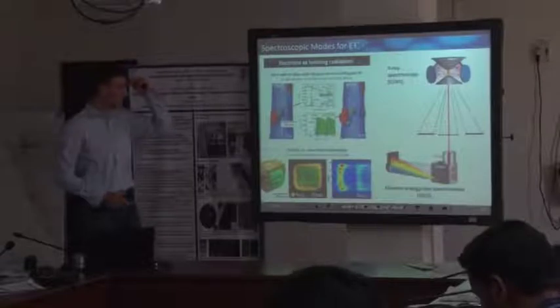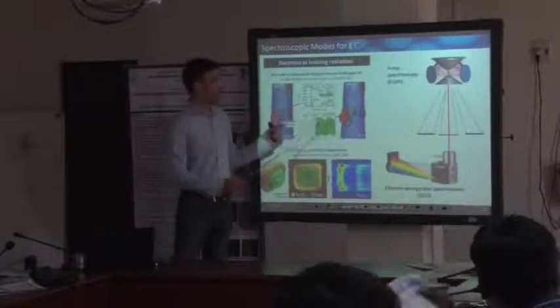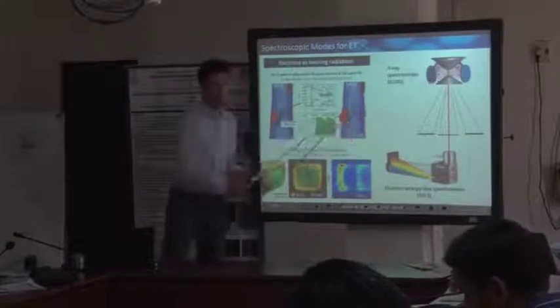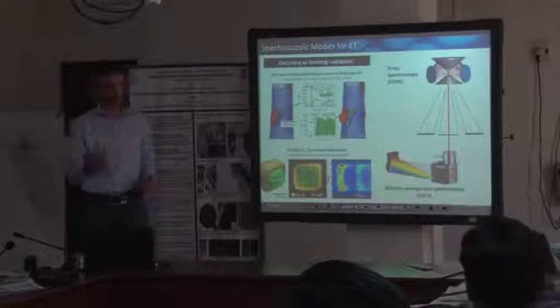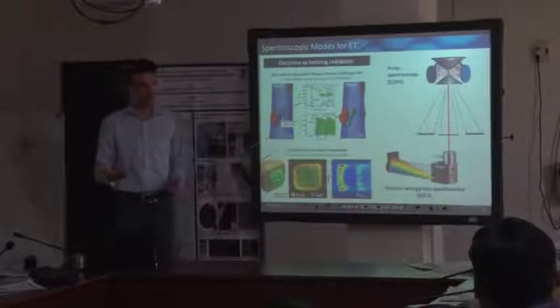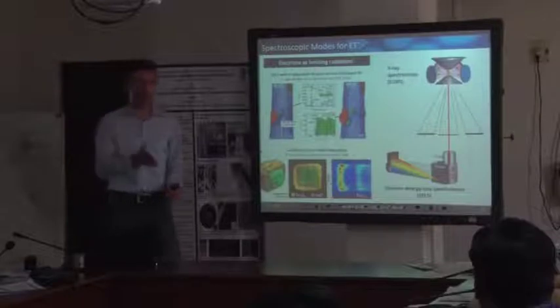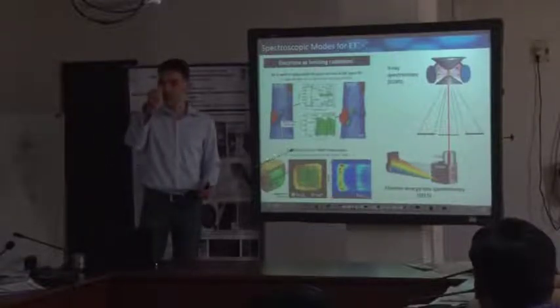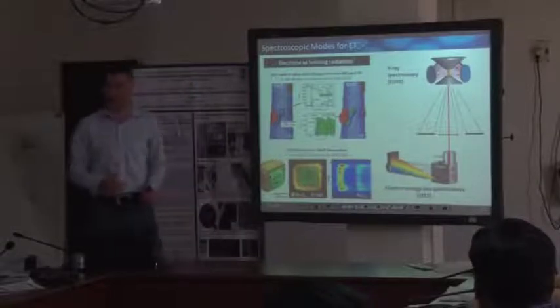You just have to keep in mind, let's imagine that you record an X-ray mapping along one projection. If you tilt to very large angles, you will end up with some shadowing. And you would have to deal with all the absorption for very large tilt angles. The path of your electron beam through the sample gets longer and longer. For 70 degrees, this is already pretty long.